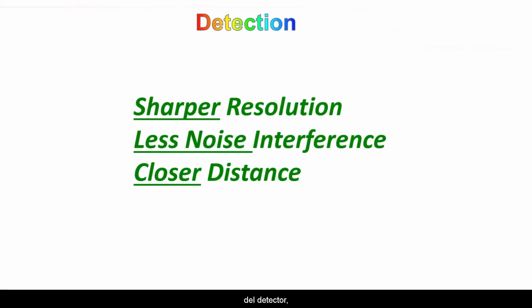Summarizing the important attributes of the detector, you want a digital detector that has sharper resolution with less noise and interference and as close to the target as possible. This is critical to have in the state-of-the-art XRF machine.